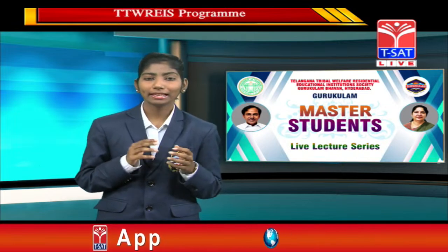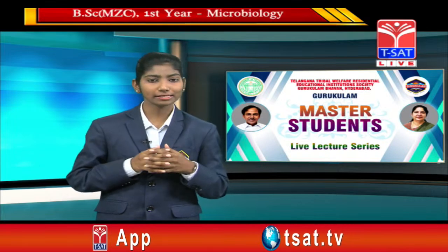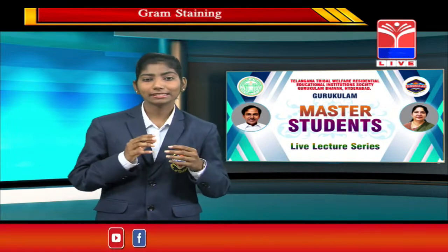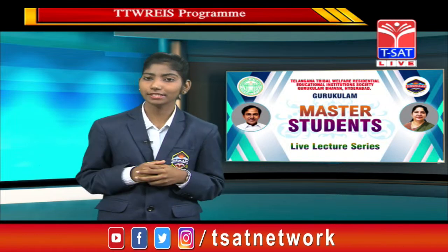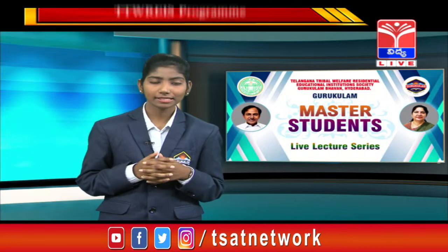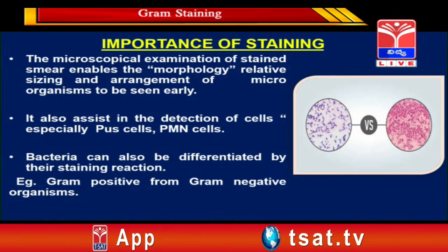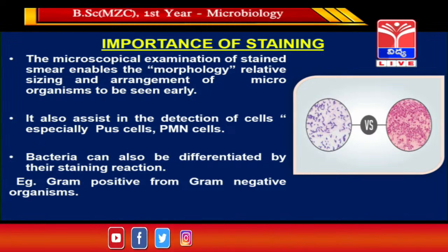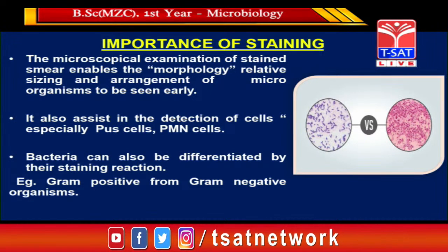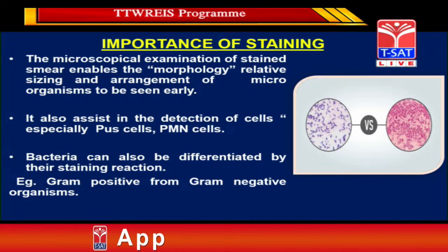For example, especially the pus cells and polymorphonuclear cells. Friends, Gram staining is also helpful in the detection of cells such as pus cells and especially polymorphonuclear cells. And bacteria can also be differentiated by using these staining reactions, for example, Gram positive from Gram negative organisms.